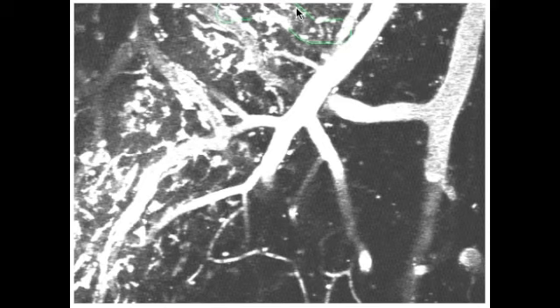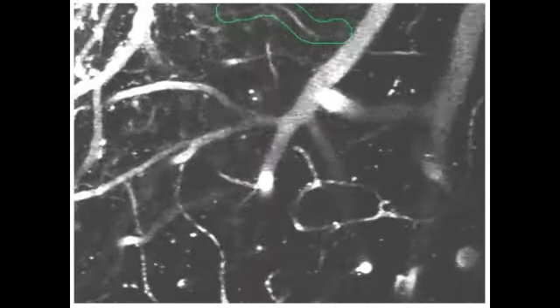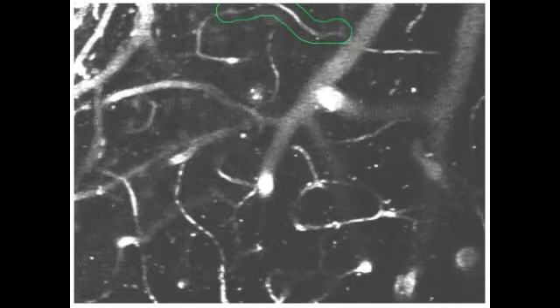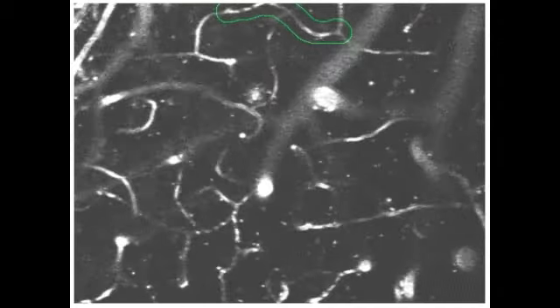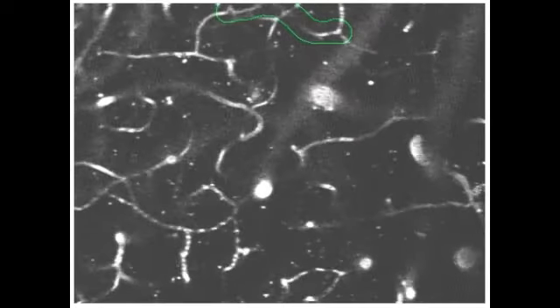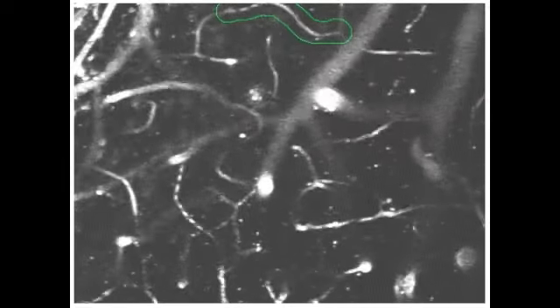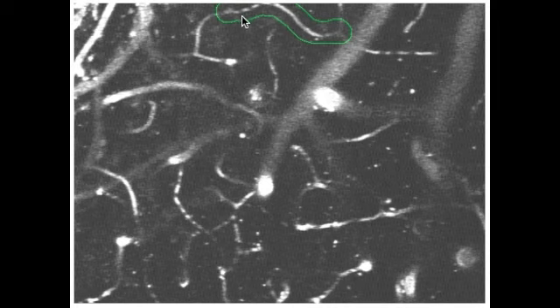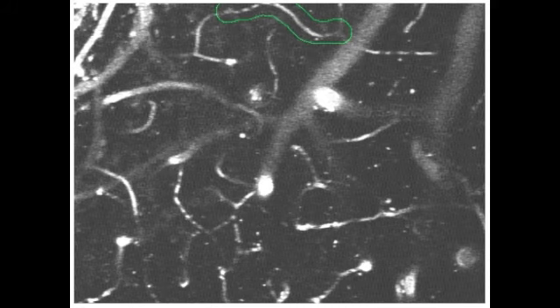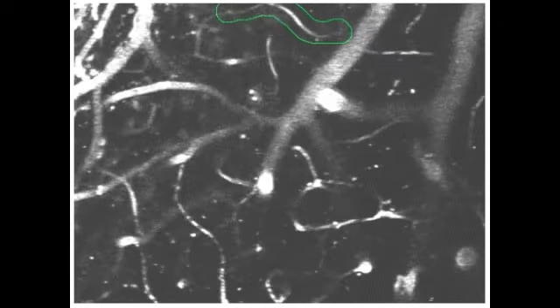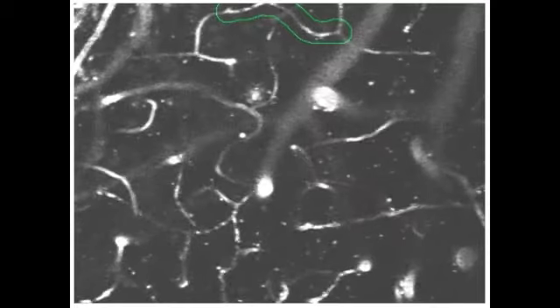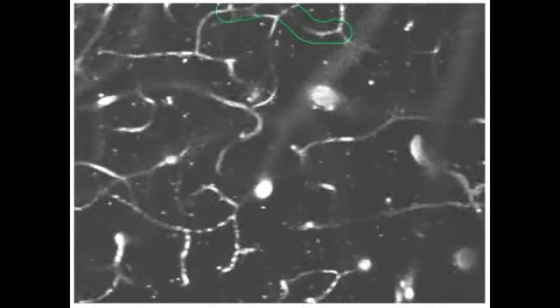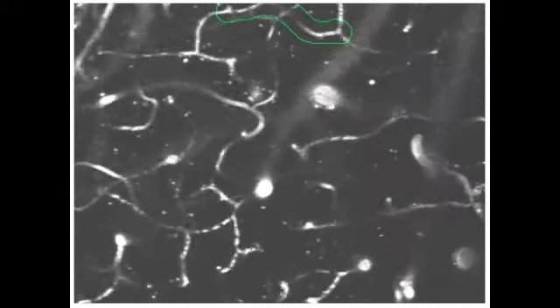It's very difficult to see this green outline because of the bright vessels behind it. But as we use our slider and those vessels go out of view, it's much easier to see the green outline, and the vessel we're annotating is also very visible. You can see the little black spots — the red blood cells — flowing through that vessel. Here's a black spot, here's a black spot, here's a black spot. These black spots are not stalled because when we move the slider, those black spots are moving. If they didn't move, that would signify a stall. But in this case they're very clearly flowing — there's really good blood flow. It's a healthy vessel, so we'll mark it flowing.